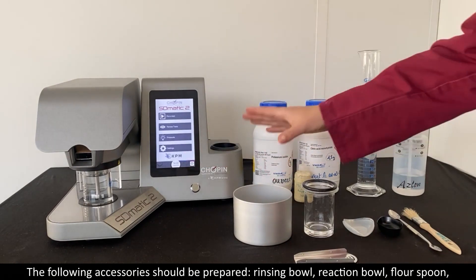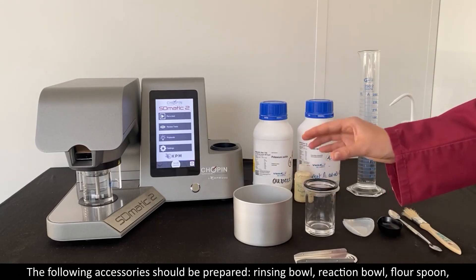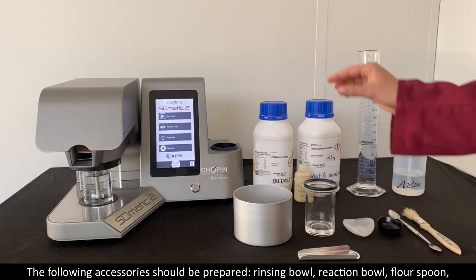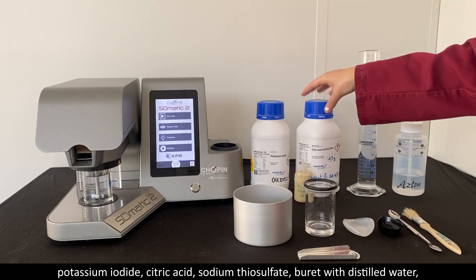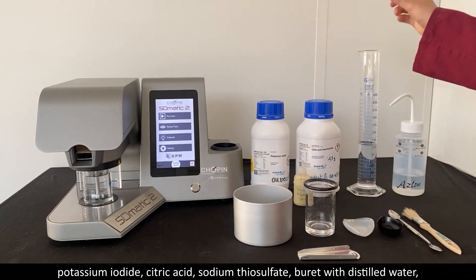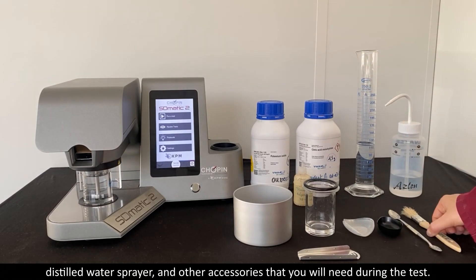The following accessories should be prepared: a rinsing bowl, a reaction bowl, a flour spoon, potassium iodide, citric acid, sodium thiosulfate, a beaker filled with distilled water, a distilled water sprayer, and other accessories that you will need during the test.